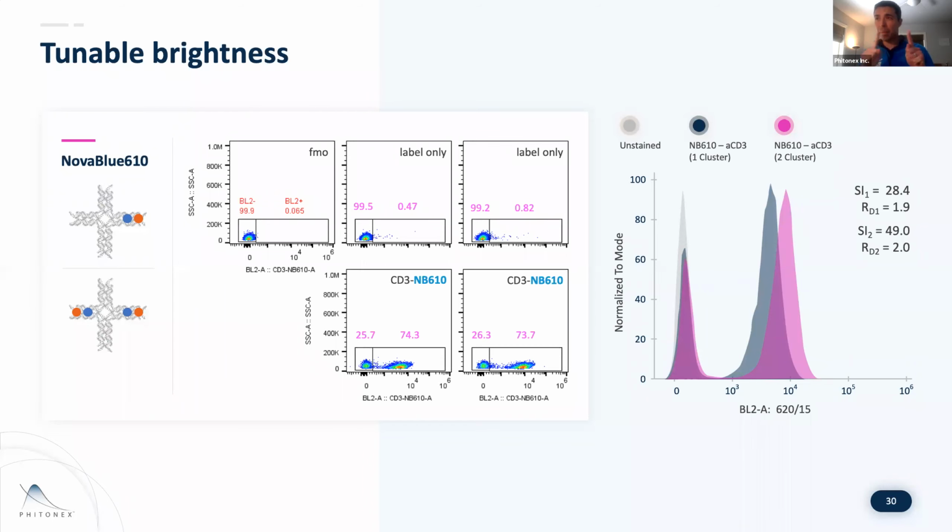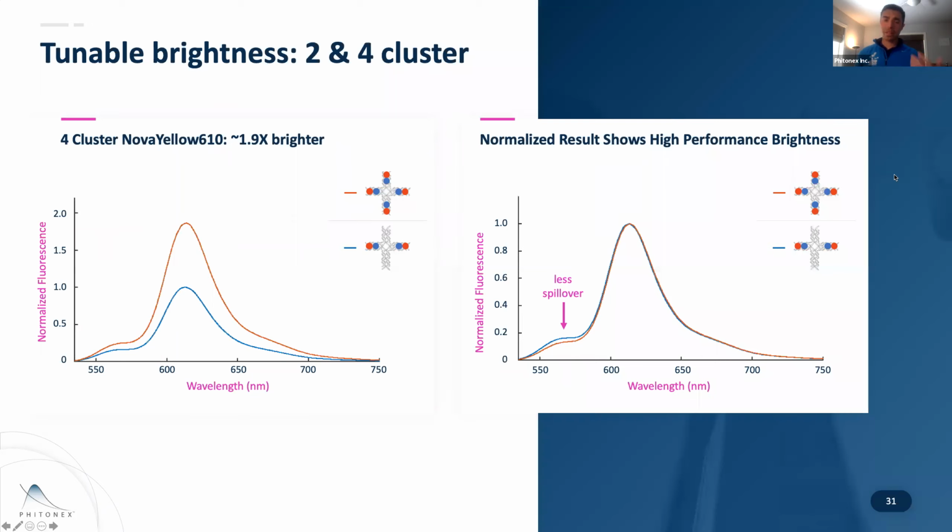So I am actually increasing, if you look at this, the staining index, the separation index, the ability to actually separate these populations. And I think that's really interesting when we think about, I've got this low or mid expressing population, and it's saying, okay, let's increase the separation index of that, but let's do it without compromise. So how do we do that? Let's push that even harder.